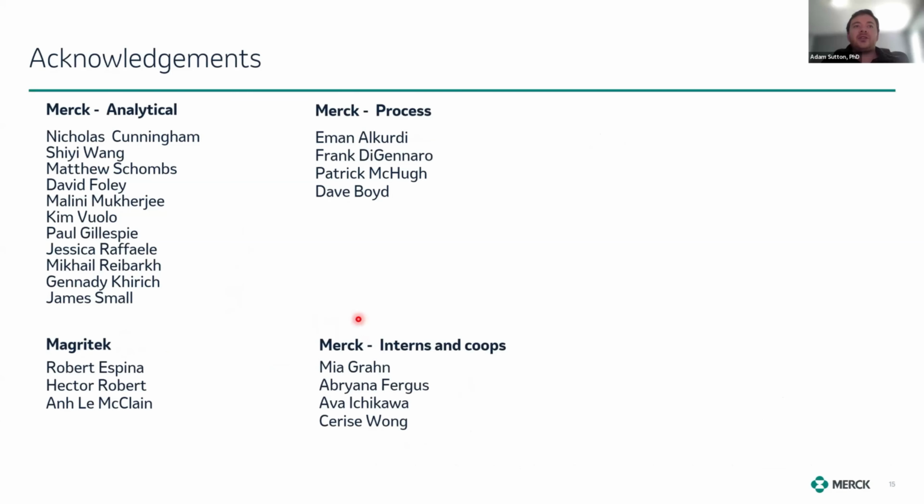And we also have had a sweep of interns. So for us, we know that if all these interns can handle this benchtop NMR technology easily, any other scientist can as well. And so there, I'm happy to answer any questions.